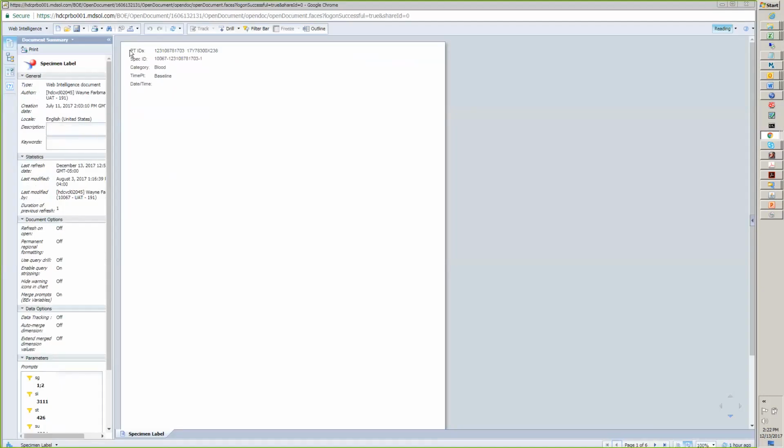So here is a label as things currently stand. We have a little error message. We'll ignore that for now so that we don't lose the screen. On the patient IDs on this particular label as it stands now, the treatment patient ID is not included. And so that might be changing. We may end up putting the treatment patient ID on here.